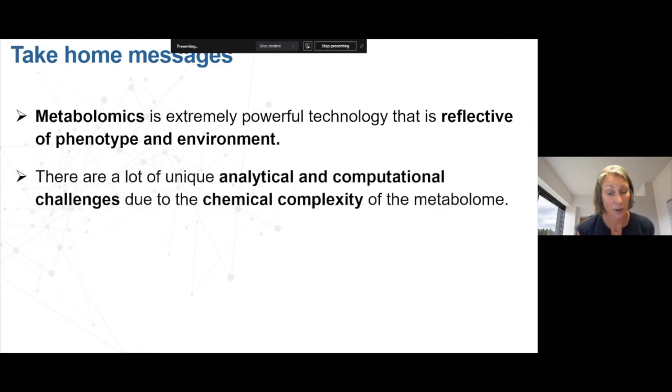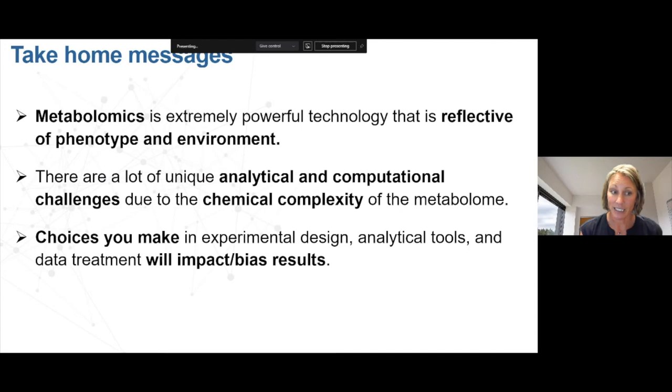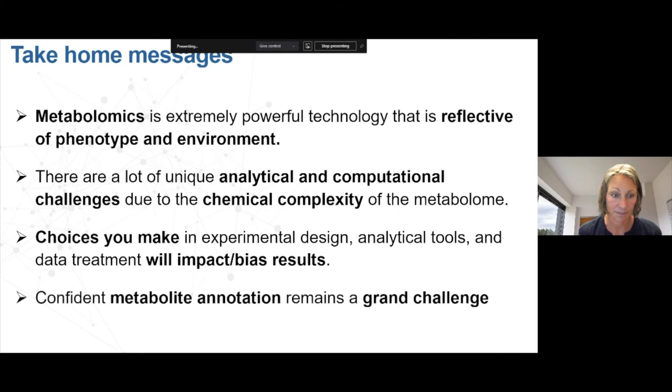There are a lot of both analytical and computational challenges in metabolomics that are somewhat unique to metabolomics due to the chemical complexity of the metabolome. Because of this, the choices that you make in the experimental design, the analytical tool you use, and how you treat the data are going to impact or bias the result. And this is not necessarily a bad thing. It's just important to understand. So you make these choices intentionally, and you are transparent when you report your results.